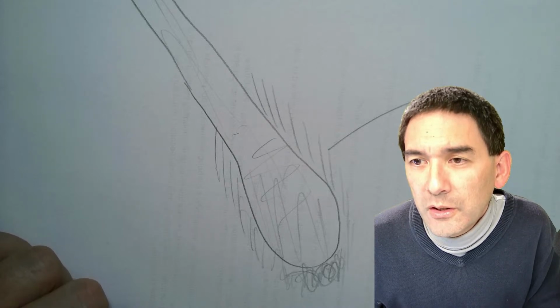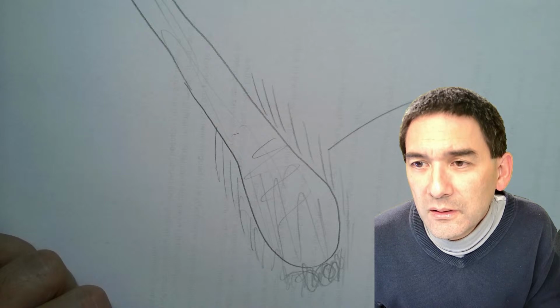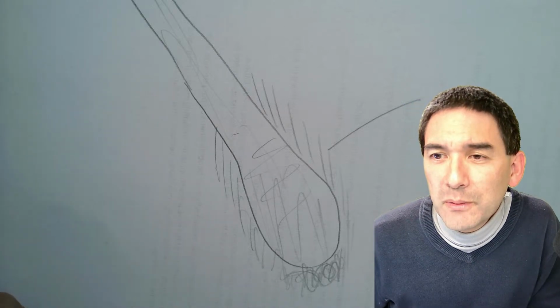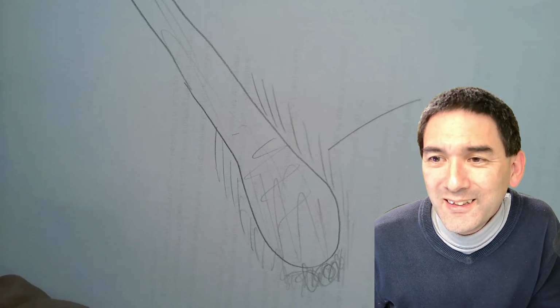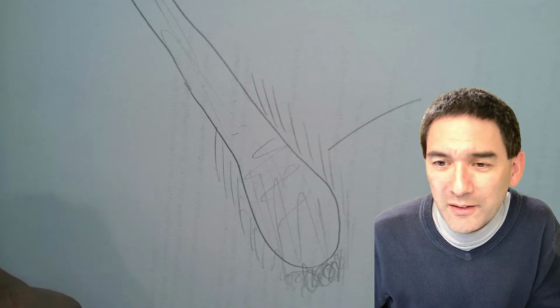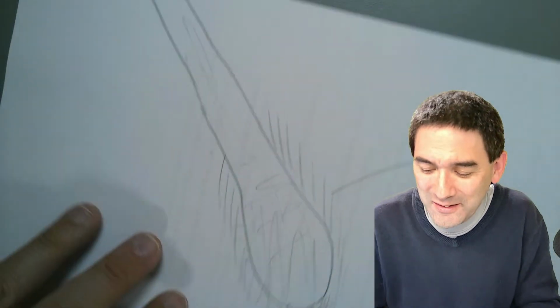No matter how many slices and names, the bigger, simpler picture is always lost on lab conditioned minds. The monkey tail is like an all-in-one specimen, because it contains so many interesting things. What am I going to do now? It's almost 1.5 hours again.